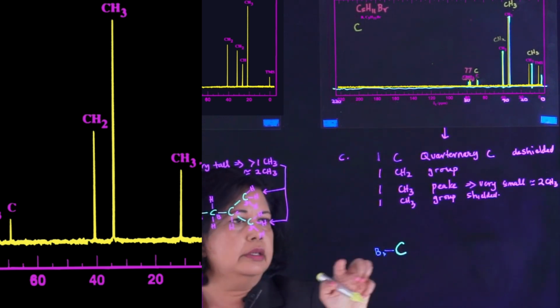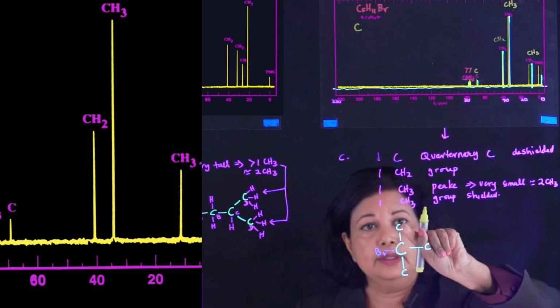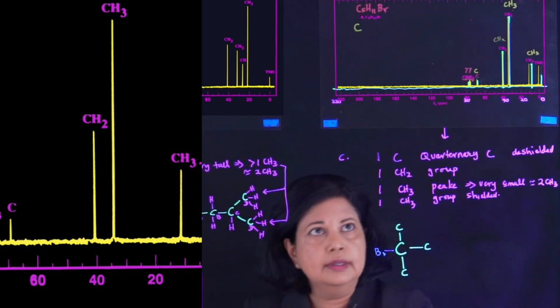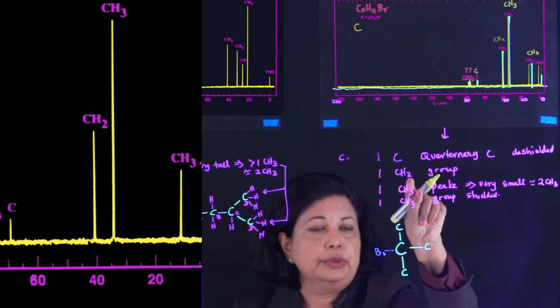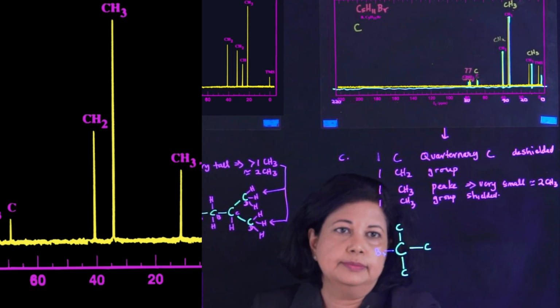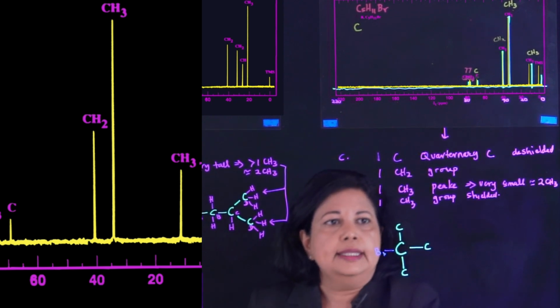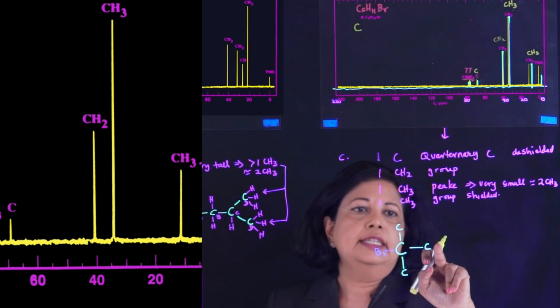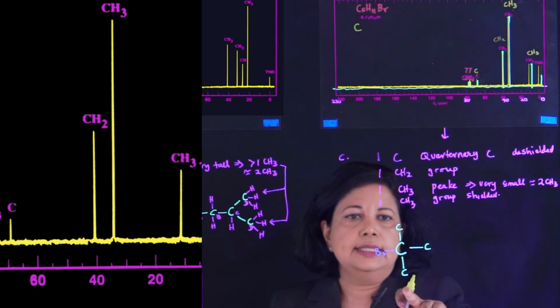And because it's quaternary, you're probably going to have 3 carbons on it. So that's 4 carbons. Where is carbon number 5? Obviously, you have a CH2 group. One of these would be attached to a CH2. Let's look at that. So here, if you're going to do another CH3 group that's shielded, it's probably going to be attached to this, this, or this.